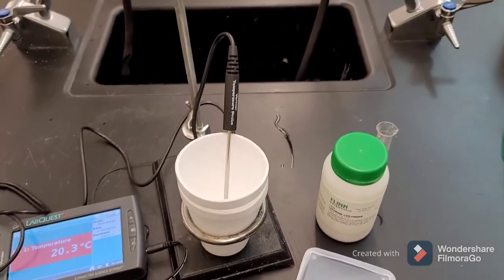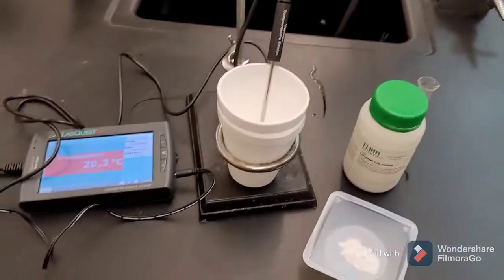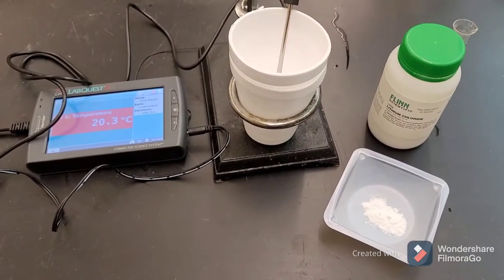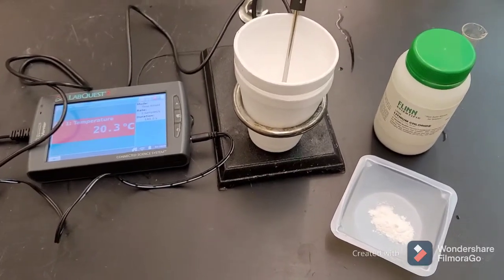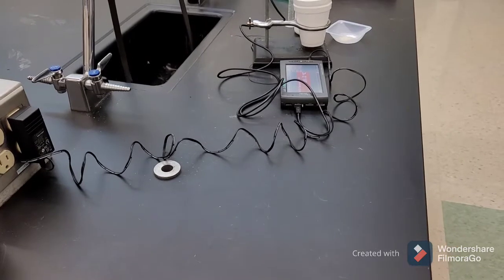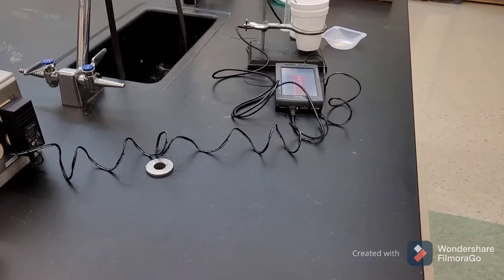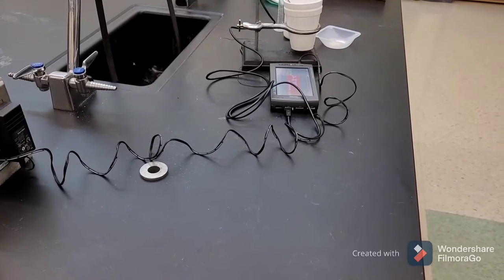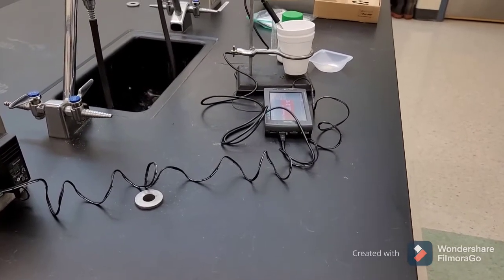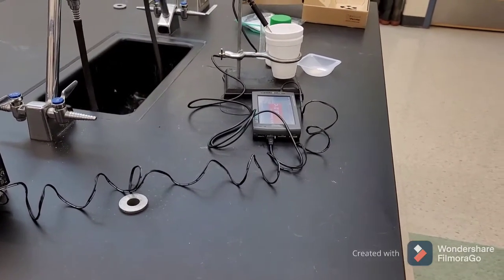So if you want to pause this video, look at that data table and see if you can come up with your rule now. How are you going to know if it's endo or exo? You need to be able to decide, for any of those materials that they give you on page 322 in Lab 20, if they're going to be endothermic or exothermic when you dissolve them in water.